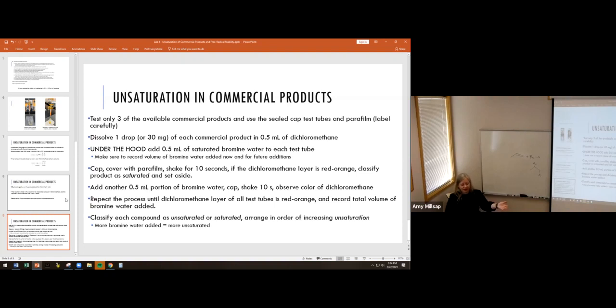I expect this liquid safflower oil, because it's a liquid, it probably has double bonds. I expect it to react with bromine. I do not expect this butter to have a huge reaction with bromine. That's it.